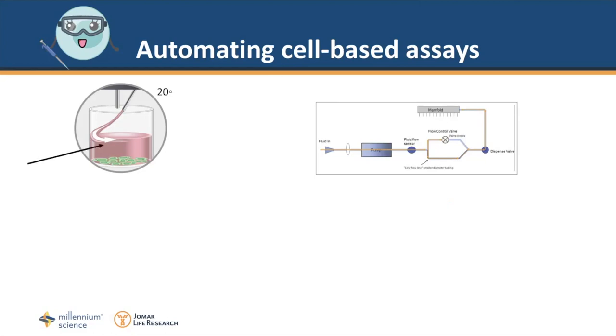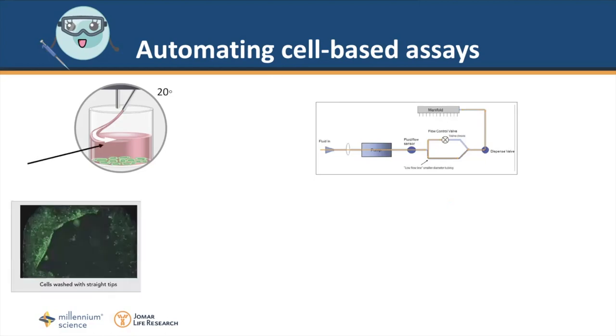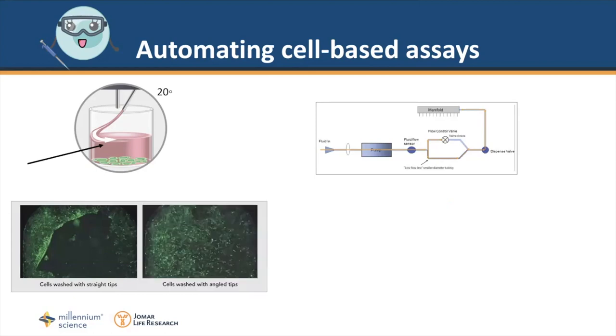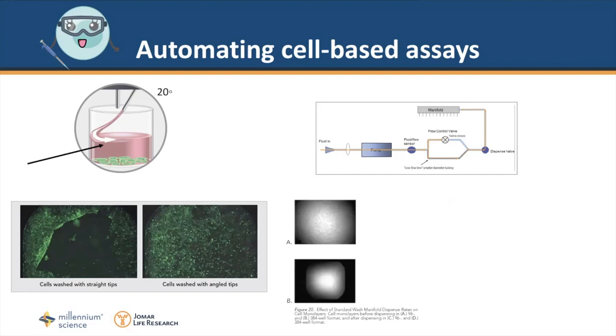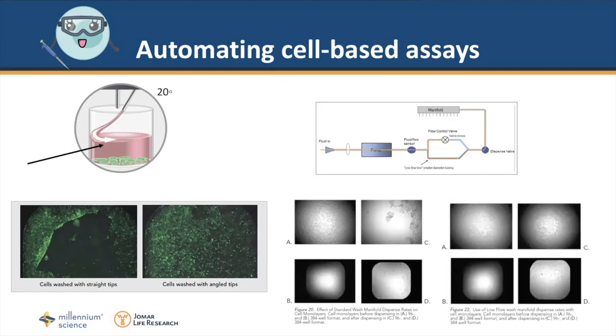Here is an example of cells washed with straight dispense tubes and the benefit of angling these tubes to the cell layer. Altering fluid flow is another way to reduce the vortex-like effect that is created by dispensing. You can see here an example of the damage from using standard dispensing rates on cells in a 96 and 384 well plate respectively. Here you can see the benefit of altering the fluid path.